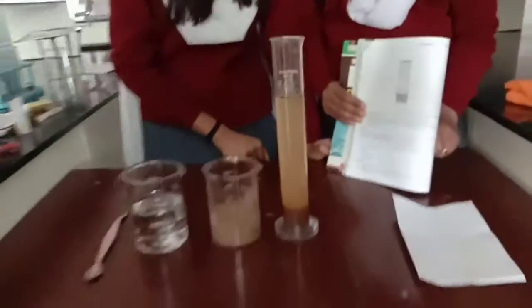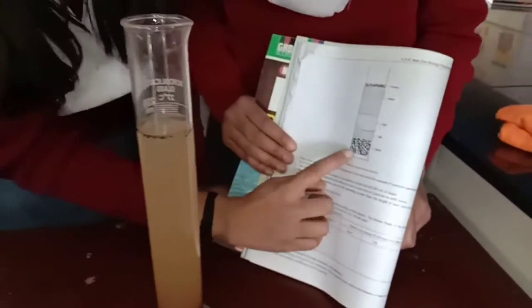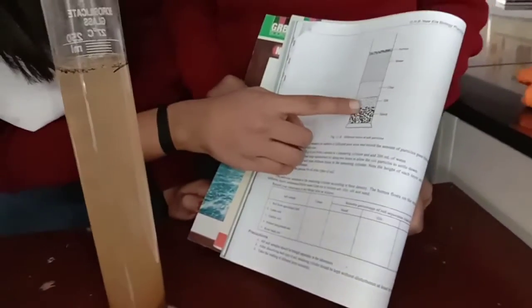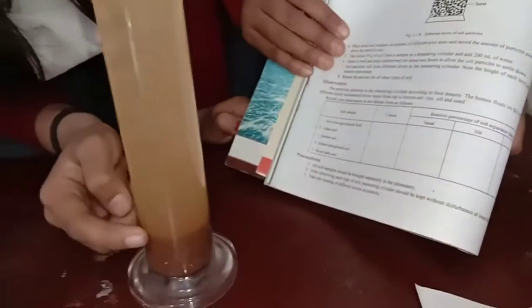Let's go through our book here. Now you can see the texture of the soil sample. First of all, you see at the bottom sand has settled down. After that the silt you can see here. After that the clay particles can be observed easily here.